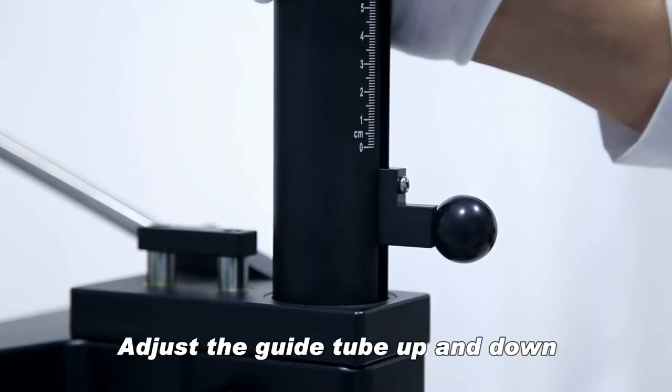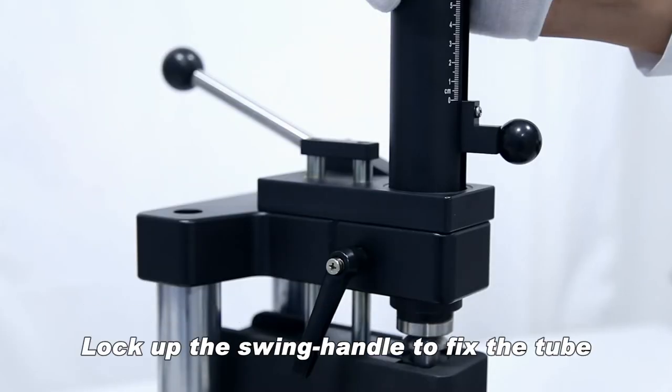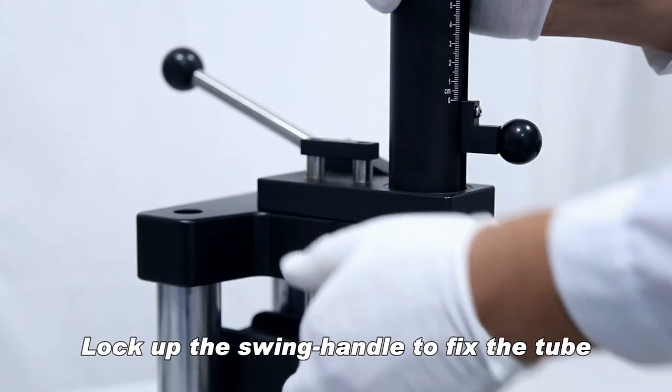Adjust the guide tube up and down to ensure the top of the weight handle is at the zero mark of the tube. Lock up the swing handle to fix the tube.